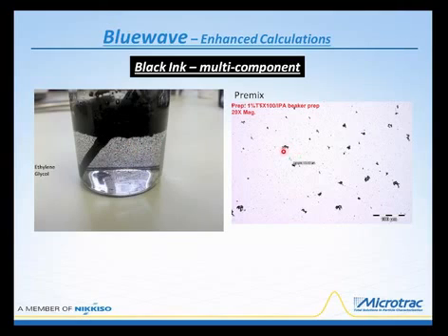This is a premix, and instead of using ethylene glycol, Tony Weigel, our laboratory manager, put together a solution of isopropyl alcohol, and this is 99% isopropyl alcohol, and made it 1% in Triton X-100. Merely by mixing the ink with this material, you'll see a lot of agglomerates, but this is not the final step in the preparation. But it does provide us with information that the sample is mixing well, and we just have to look at it a little bit more deeply.